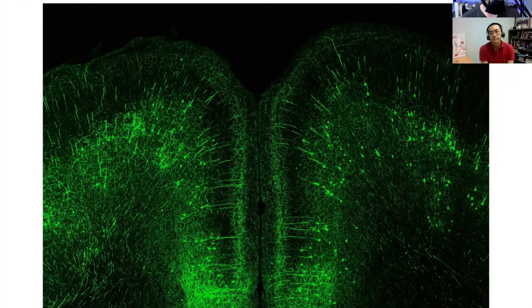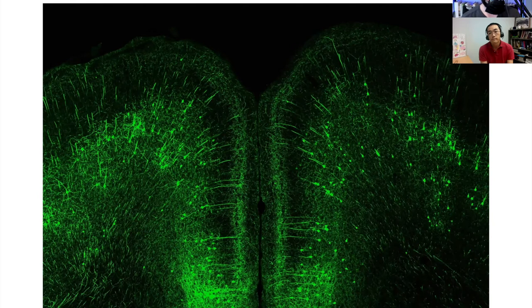Now we're moving on to this second image. Can you start to unpack this a little bit? And I want us to describe for the next few images basically just the parts of the neuron that we look at in the brain when you're studying plasticity. So what are we actually seeing here?